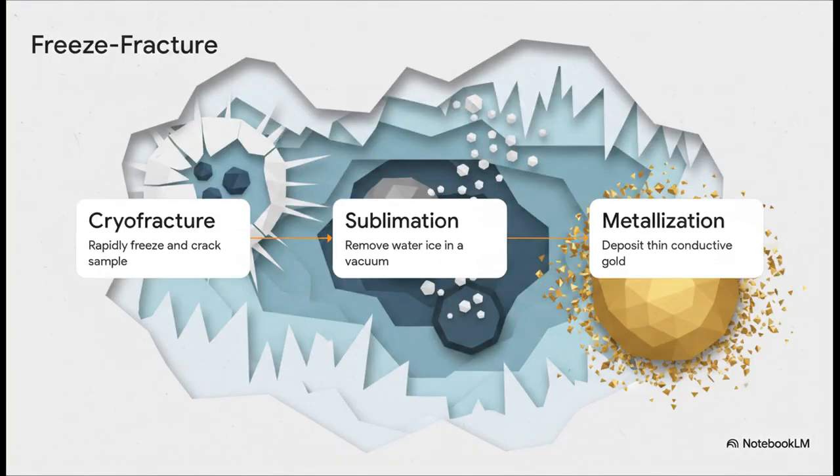Now, the prep is even more extreme if you're using a scanning electron microscope.